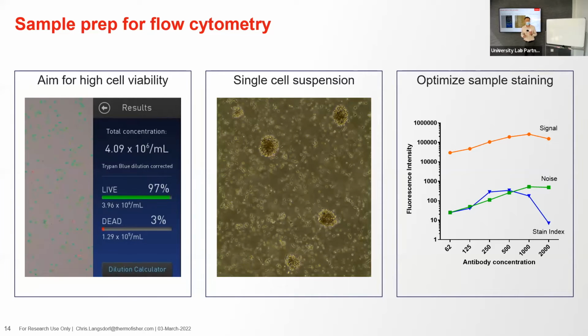The reasons for this are multiple. Any antibodies that you're using to label your cells, like the PE conjugates we're talking about, dead cells will non-specifically soak up antibodies. And so they will be positive for all kinds of markers that aren't actually present, because antibodies non-specifically bind to dead cells. So we want to have as many live cells as we can, but beyond that, we'll use a viability dye in every experiment to ignore all of the dead cells in our sample and only analyze live cells. It gives us a much clearer picture of what's going on.